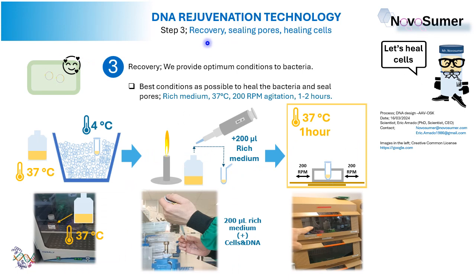Okay, let's go for the third step, the recovery of the cells, which is equal to sealing the pores, healing the cells. This third step is just making the cells happy again, leaving them in a nice environment to heal. A nice environment for them to heal is an environment with a rich medium.